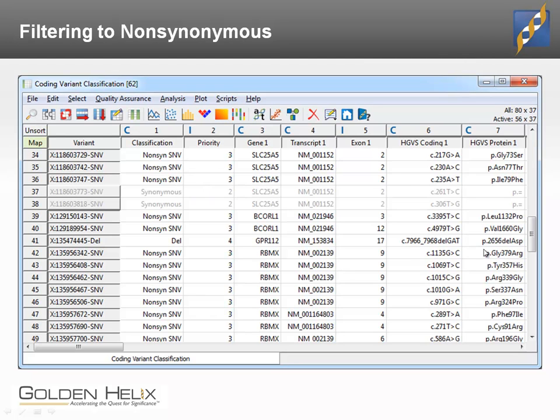Because of redundancy in our amino acid encoding from nucleotides, there are certain variations that, even though they go from, for example, a T to a C in this position, do not change the protein sequence, and we want to filter those out. We want to look at only coding variants that are non-synonymous. Again, we don't care if they're insertions, deletions, single nucleotide variants or nonsense mutations, but we want to filter out the synonymous variants.